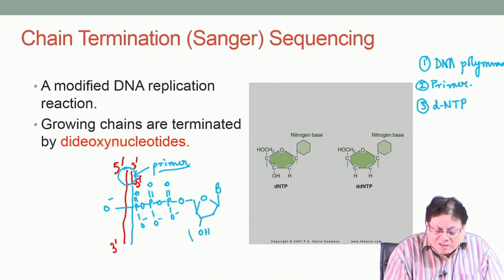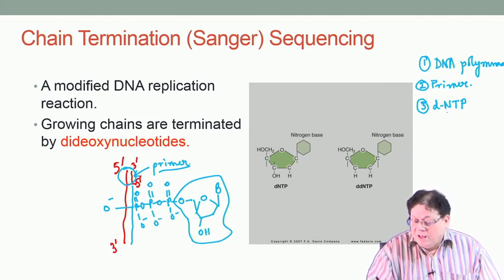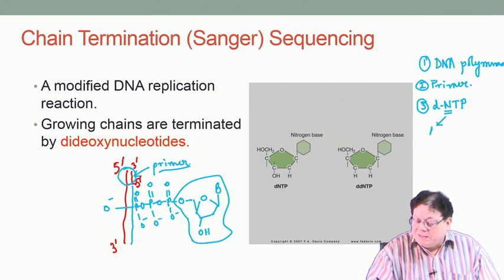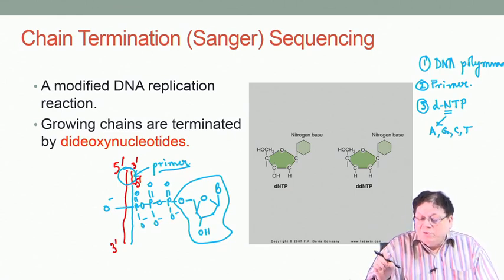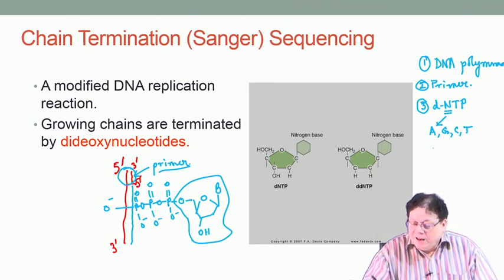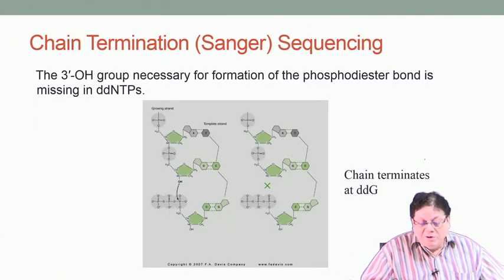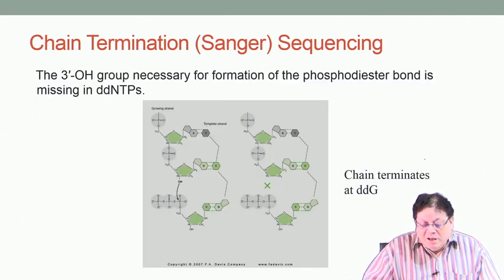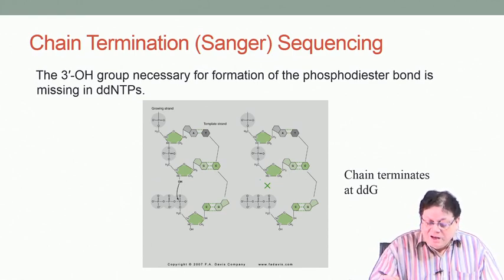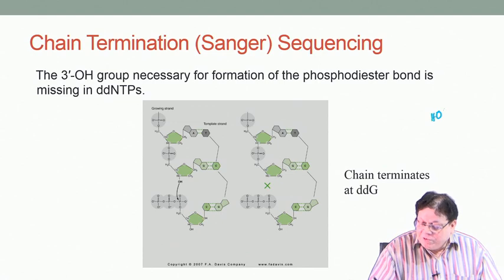Because up to this point is what is known as nucleoside. So, it is called nucleoside triphosphate. N stands for all the 4 bases A, G, C and T. So, basically what you need is all the 4 deoxynucleoside triphosphate. Okay. And why do you need this? Because during the synthesis of the chain, what happens is actually written here, but I can explain that you have a nucleoside triphosphate.